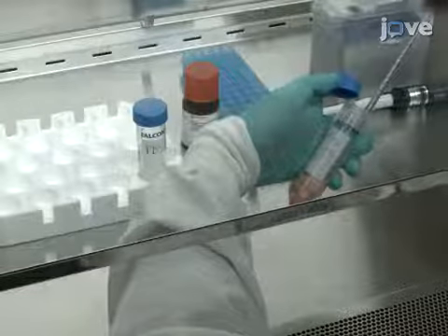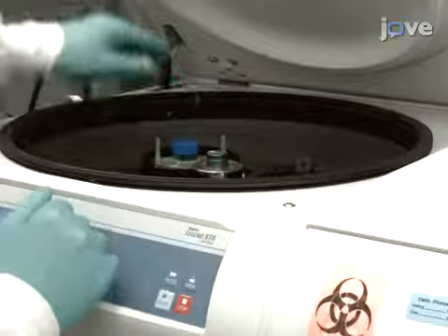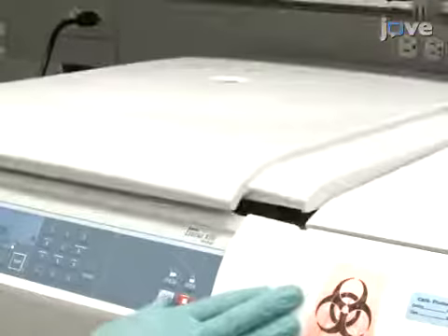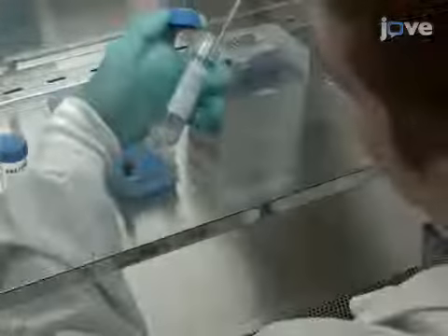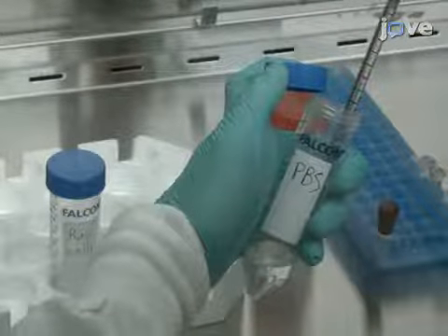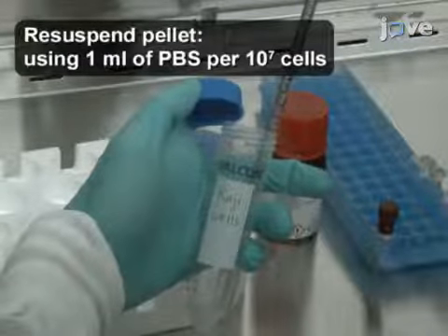Aspirate the media, add 10 milliliters of ice-cold PBS, and spin down the cells again. Wash the cells a second time with PBS, and remove the PBS after the spin. Resuspend the cell pellet in ice-cold PBS using 1 milliliter of PBS per 10 to the 7th cells.